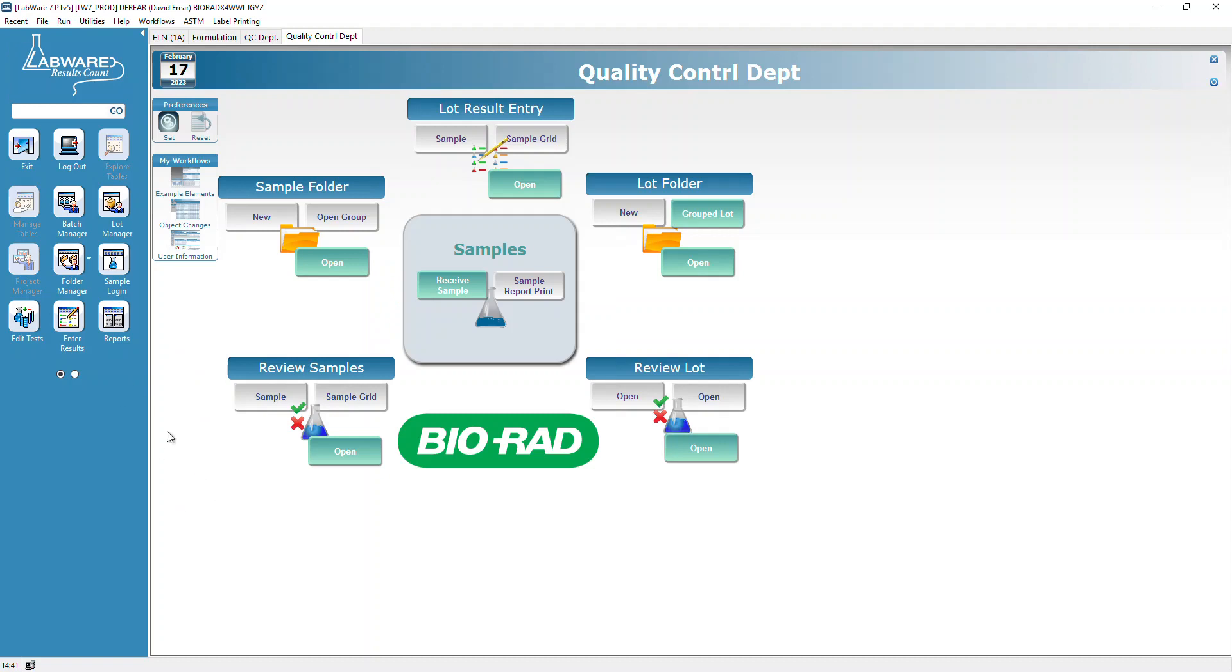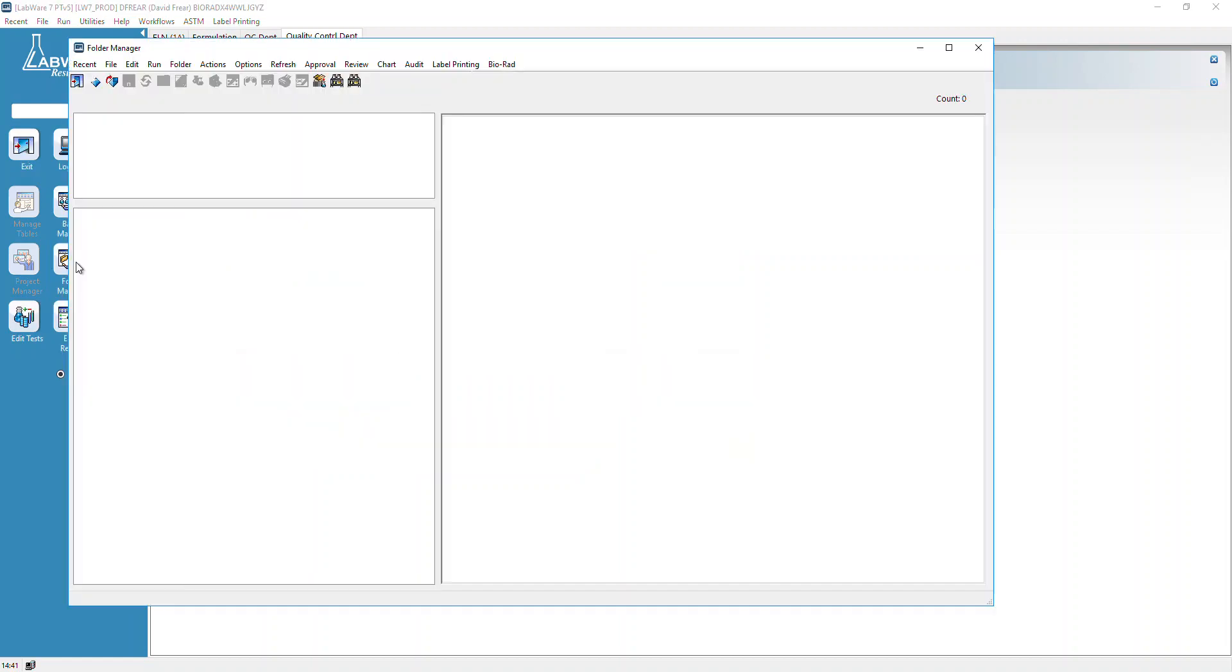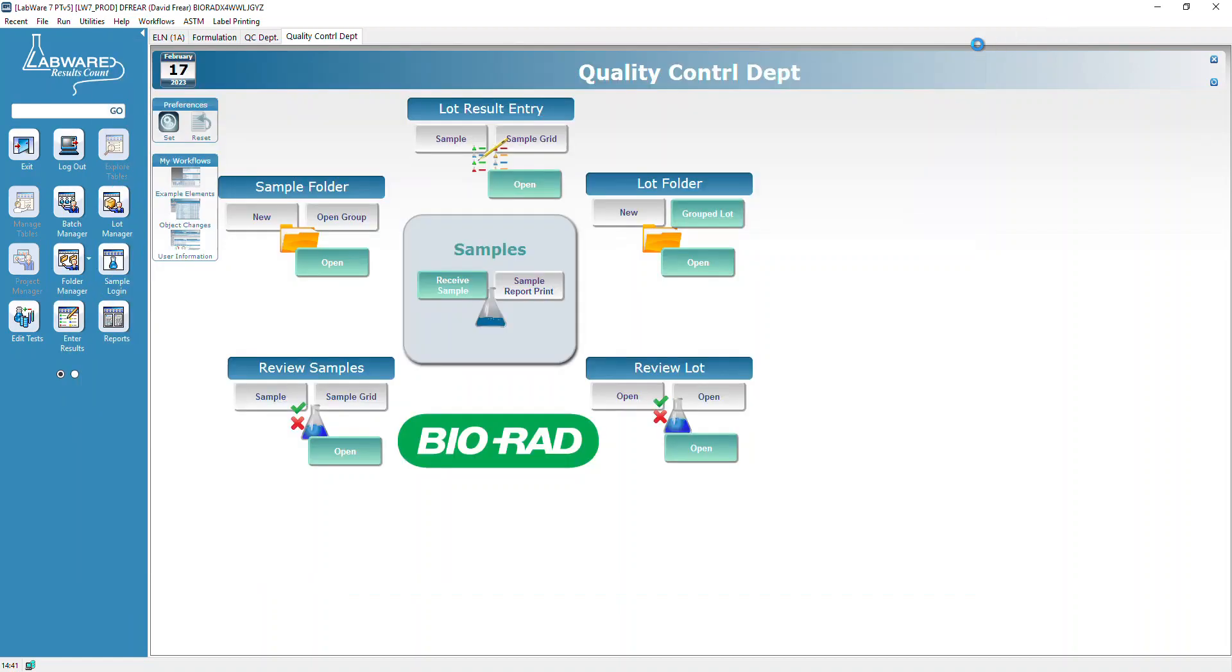We can exit out of here. Now we want to see our samples. We're going to start running those, but we're going to double-check those samples right now. We'll go to Folder Manager and open a folder.